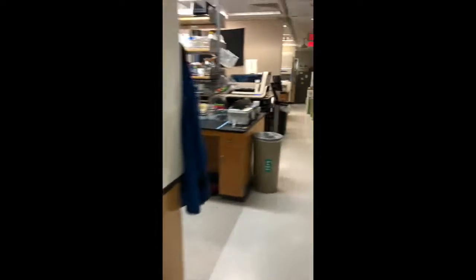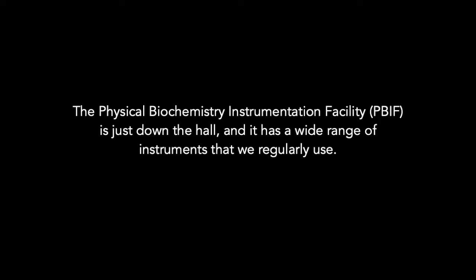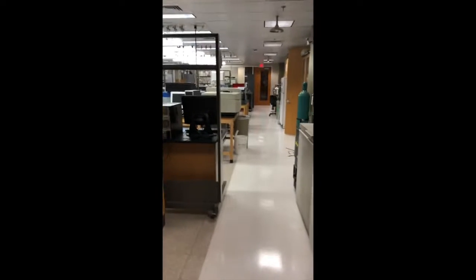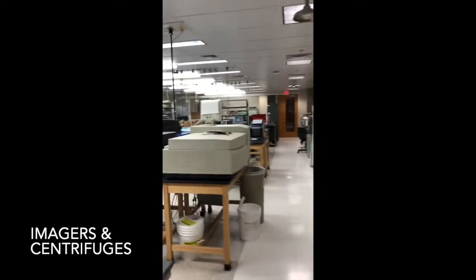So that about does it for our main lab space. And we'll zip over to the PBIF, which as this text notes is down in the hall and has a huge range of instruments that we use on a regular basis.